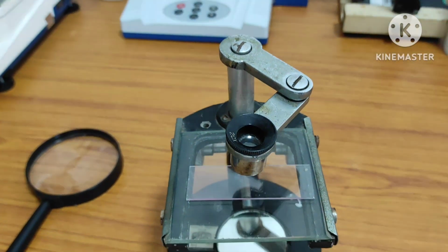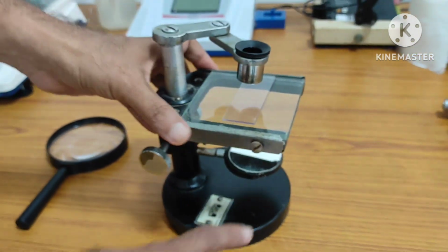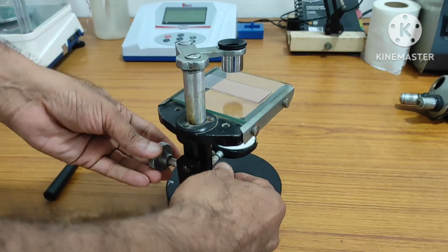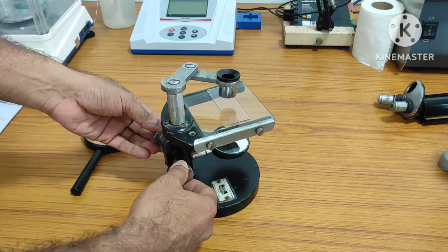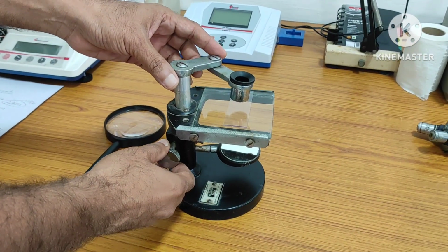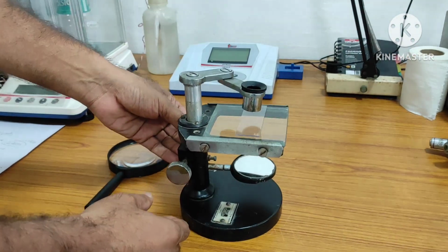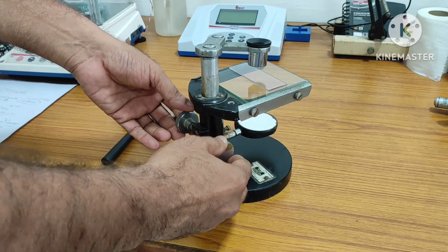A simple microscope example is this. This is the base, this is the arm, and this is the knob for adjustment. It can be adjusted based on the distance of the specimen from the lens, so wherever we find it is clear.